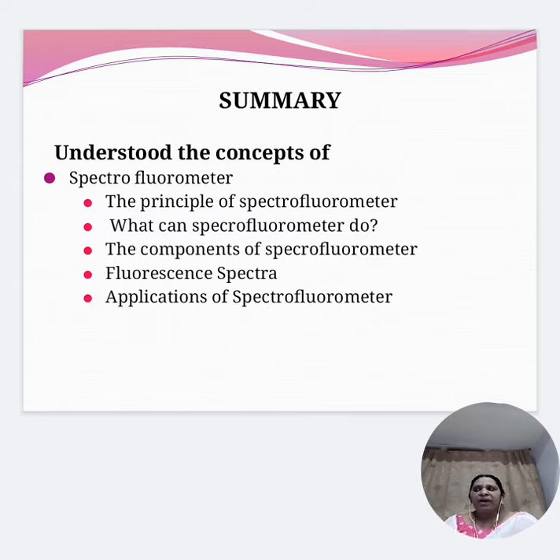So they have widespread applications. They are used for detection of environmental pollutants, in the field of geology, in the field of analytical chemistry, and in the field of biochemistry, medicine and pharmacy. So with this, we have understood the concept of the spectrofluorometer.